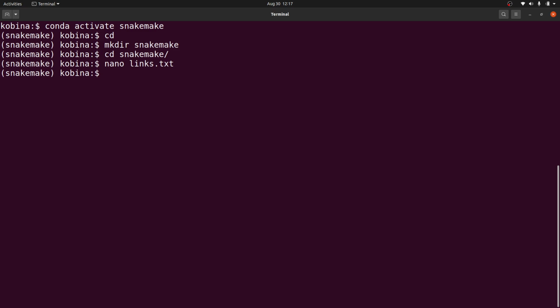So for downloading, you can use curl or wget. If you're using Mac OS, then you can use curl straight away, or you can also download them manually. Here, the most important thing is to download the file. So it doesn't matter how you download it. That one, I'll leave that to you. But for me, I'm going to use wget to get all the files.